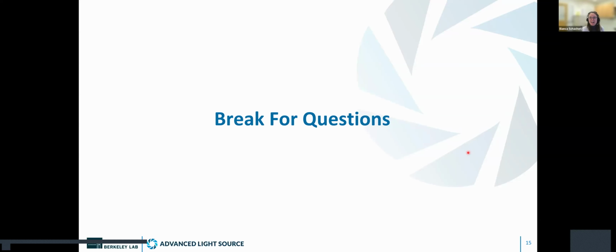Yes, hi. I just had a question about the detection method. You said that you have the CCD and a diode. The question would be, why this additional diode? Why don't you use your CCD for STXM? There's certainly a reason for this. Yeah, the diode is much faster, is the reason. Okay. Yeah, the CCD, is it also flux dependent?